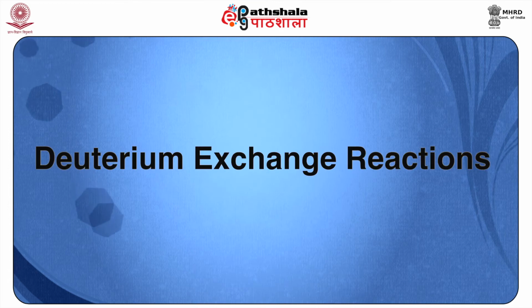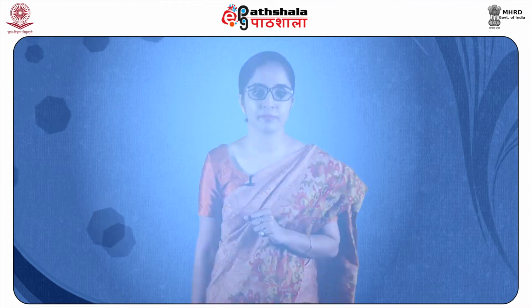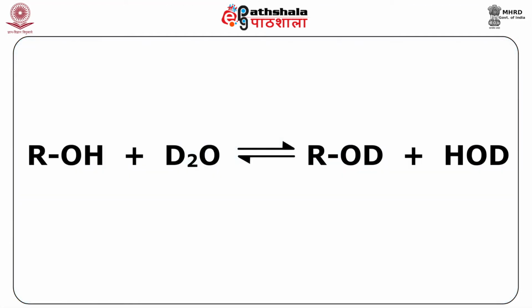Next, we come to the study of deuterium exchange reactions, that is, deuterium, which is the heavier isotope of hydrogen and which can help in the simplification of the spectra. Deuterium exchange is the most elementary and very useful technique for assigning the protons of hydroxyl, amine and SH, that is thiol, etc. groups which are exchangeable with deuterium.